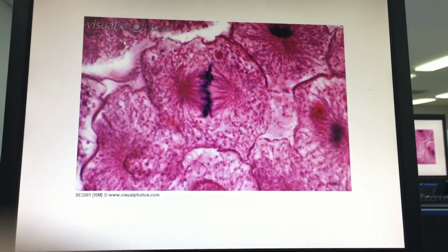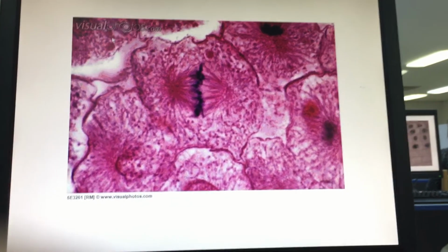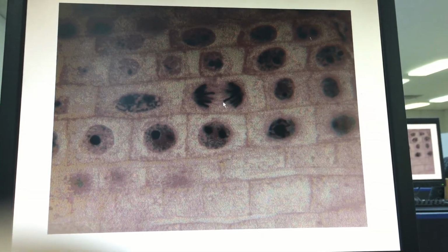Animal cells, clearly in metaphase, the chromosomes are aligned in the middle. Plant cells, this one, what stage? Anaphase, this. And this also, prophase. While the others are still interphase, but probably these two are preparing, right? The color is getting denser, but not yet. We are not in the prophase yet. You cannot see separated chromosomes yet, so you did not enter the prophase.